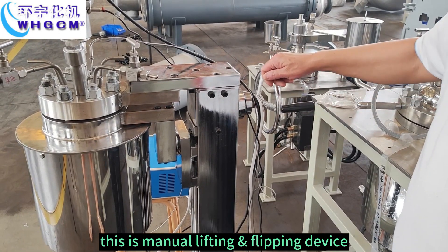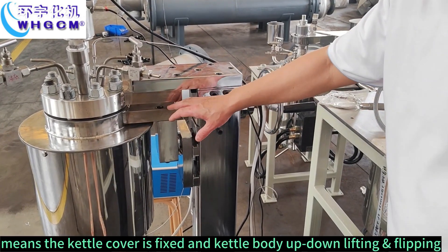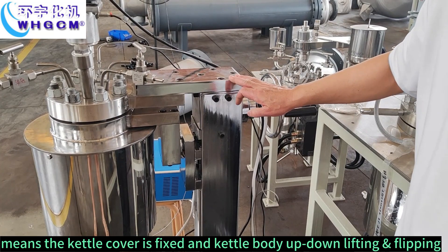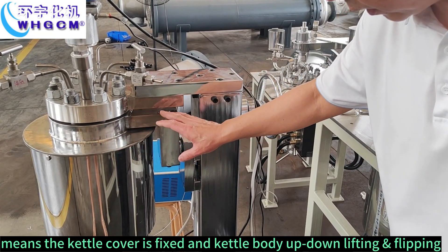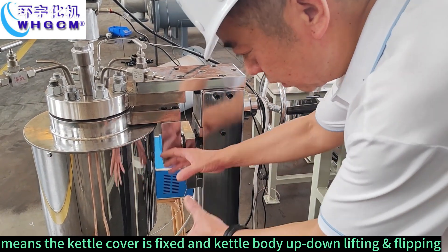This is a manual lifting and flipping device, meaning the kettle cover is fixed and the kettle body can be done lifting and flipping.